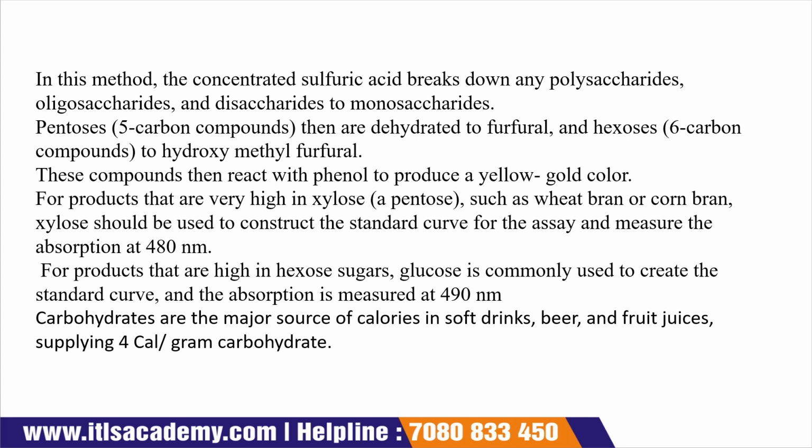Okay, so these compounds, when reacting with phenol, produce a yellow gold color. And for products in which xylose values are high, like wheat bran or corn bran, xylose must be used to construct the standard curve for the assay, and the absorption should be measured at 480 nanometer.